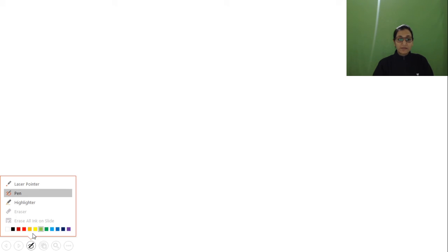Now, a common method used to isolate mRNA from tissue culture, that we are going to see now.